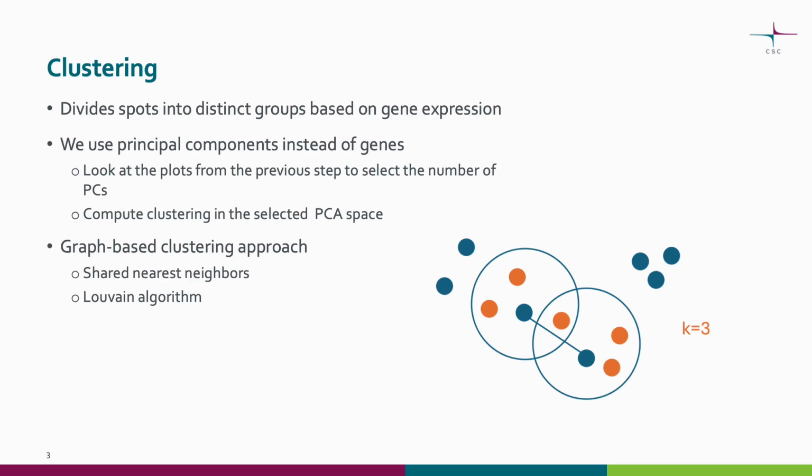We use the shared nearest neighbors approach to draw edges between the spots and form the graph. We then use the Louvain algorithm to cut the graph into clusters of spots.